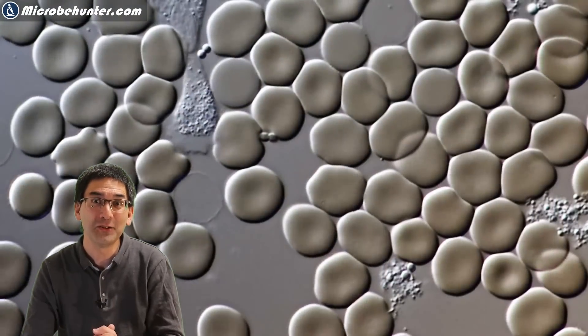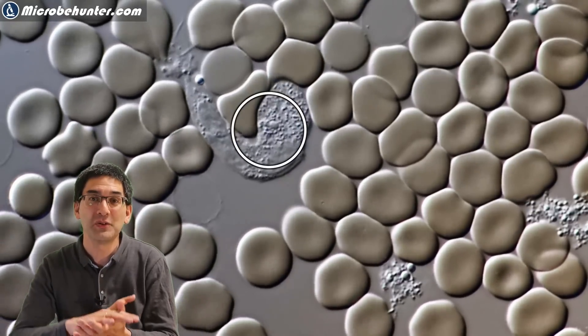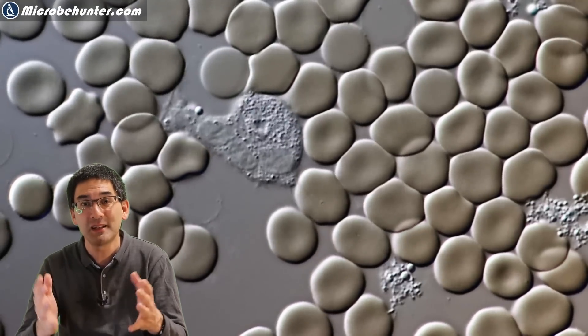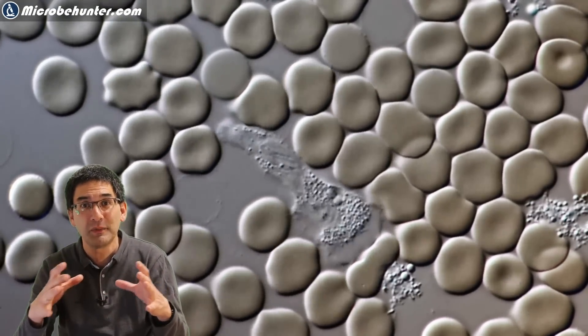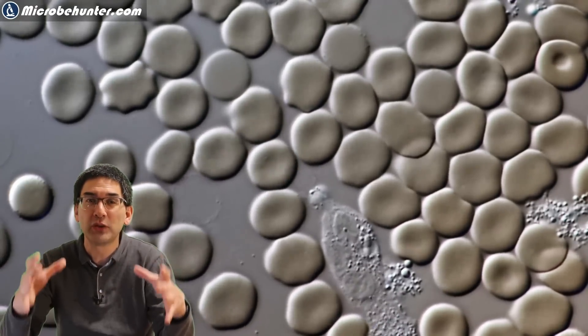These slides here show the very thin layer of blood. You see that the red blood cells are horizontal because I only used very little blood. This also shows that the white blood cells, the phagocytes, are only able to move in one plane and therefore they cannot go out of focus so quickly.